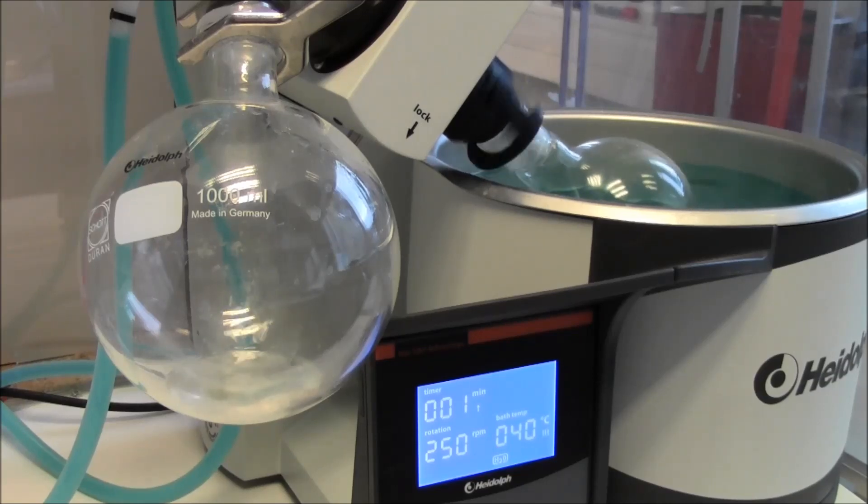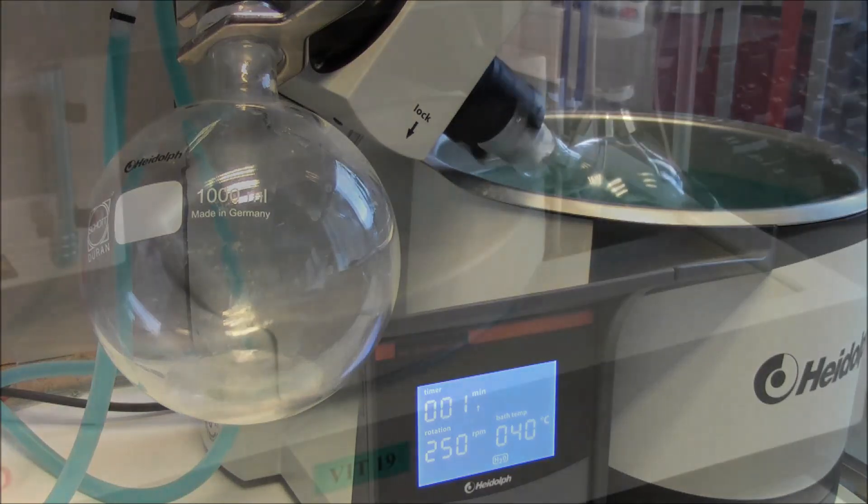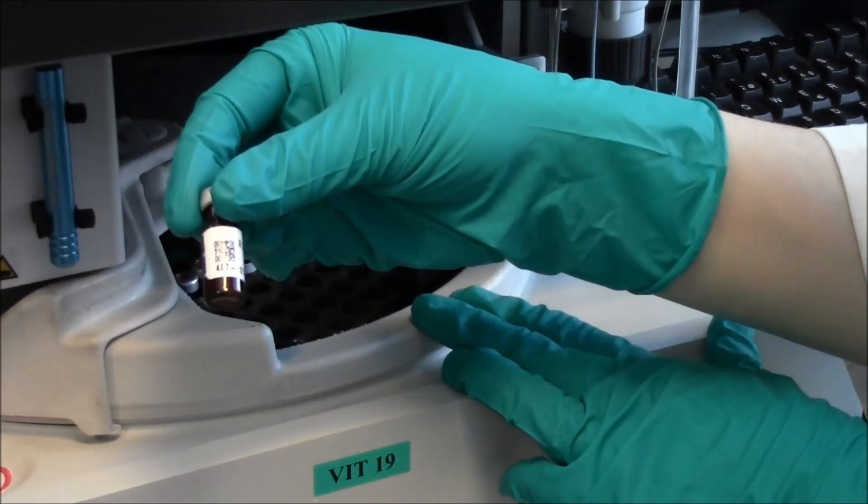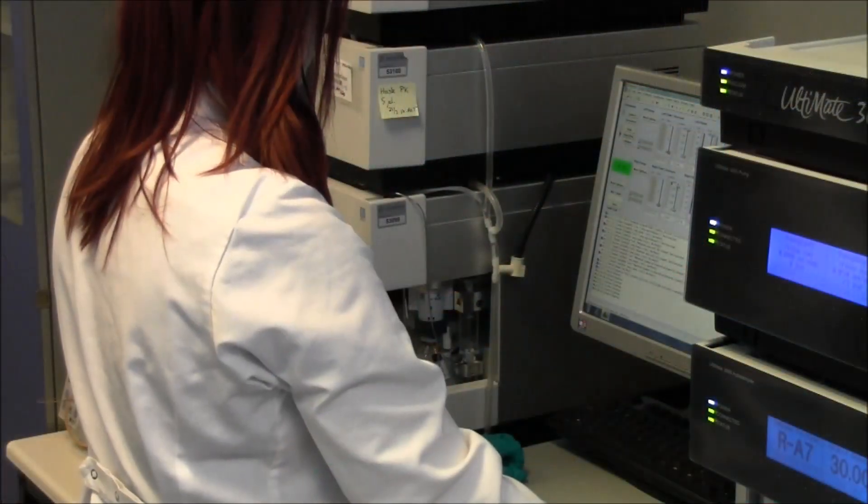Extraction is either with or without saponification. Before the samples are placed in the HPLC, the sample IDs are checked. Standards are also prepared and placed in the sequence.